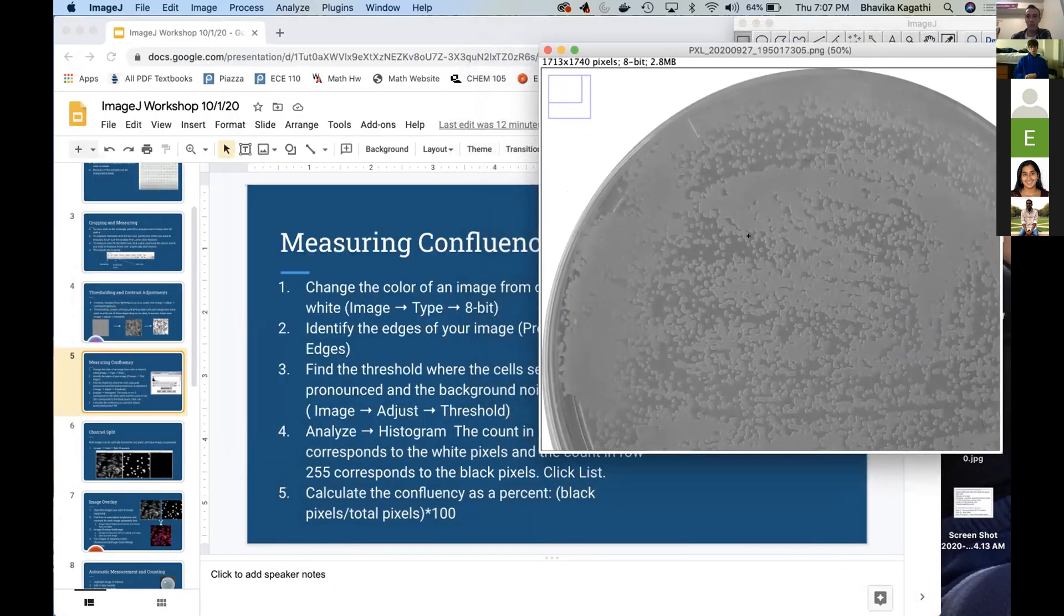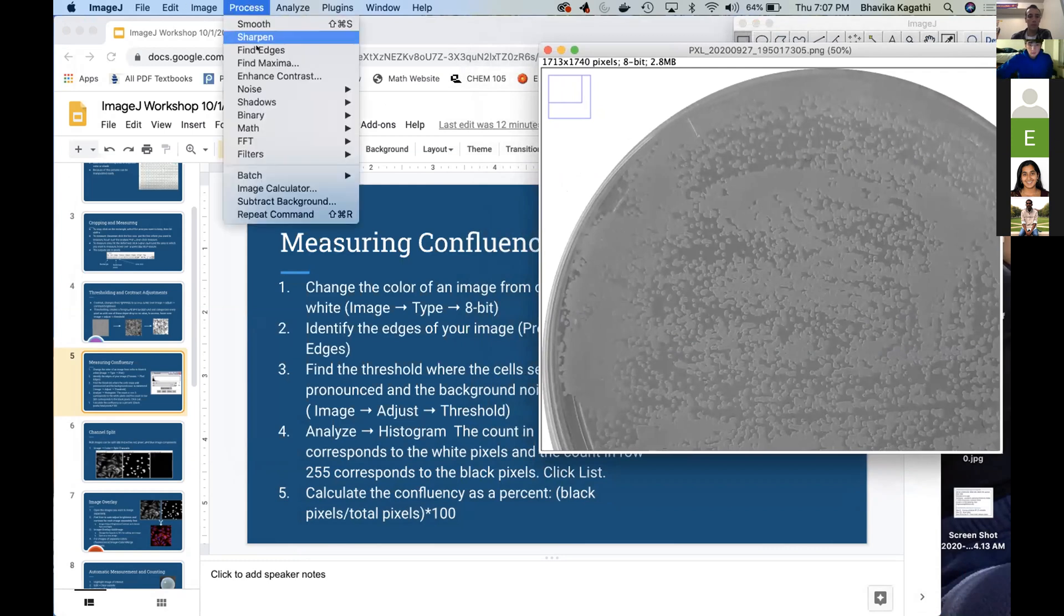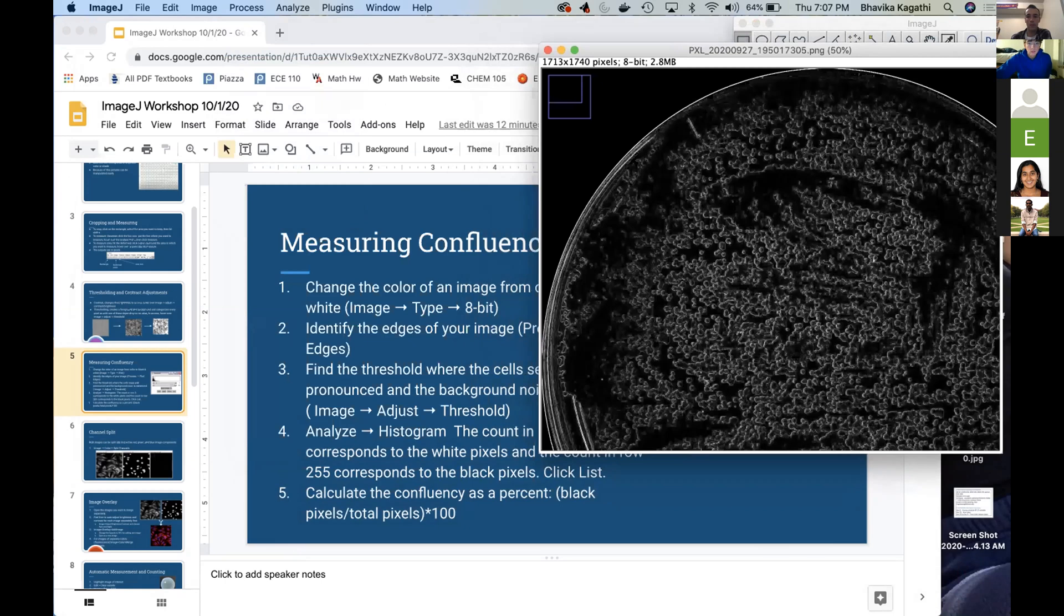And then you want to identify the edges of your image. So you're going to go to Process and then Find Edges. And so here you'll see that it highlights the outside of the plate. So that's how you know it's selecting just the part you want.